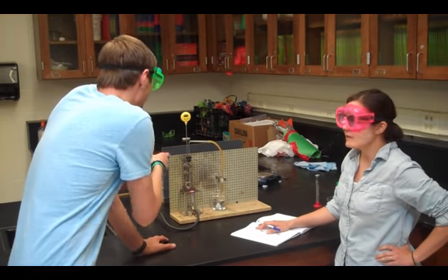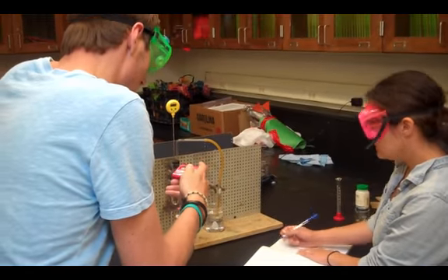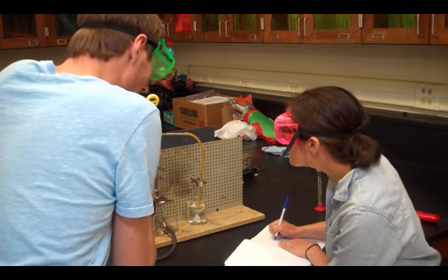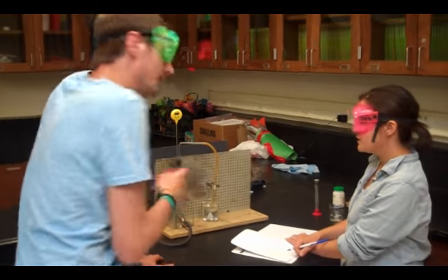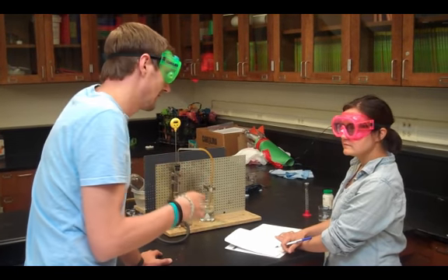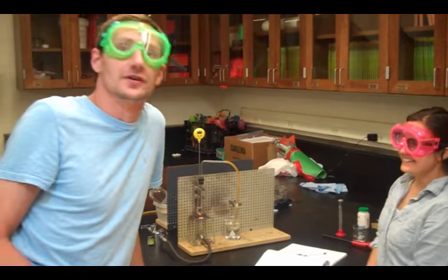So once you started your Bunsen burner, you're going to record the temperature every 30 seconds. So one of you guys will have a stopwatch while your partner records. And every 30 seconds you're going to yell time. And your partner is going to record the temperature. Then you're going to wait 30 seconds. And again, after another 30 seconds, you're going to tell them time. And your partner is going to record the temperature. And you do this for 5 minutes. After 5 minutes of recording your data, you're done with the lab.